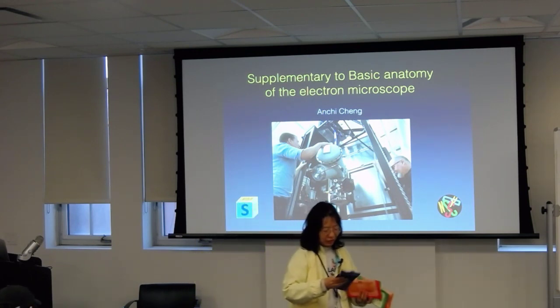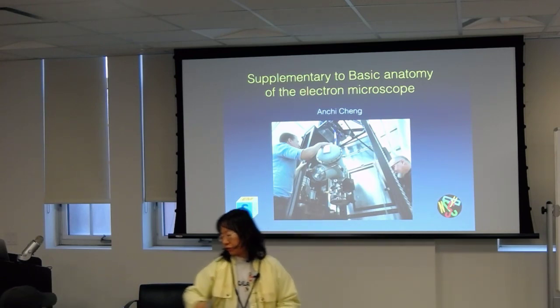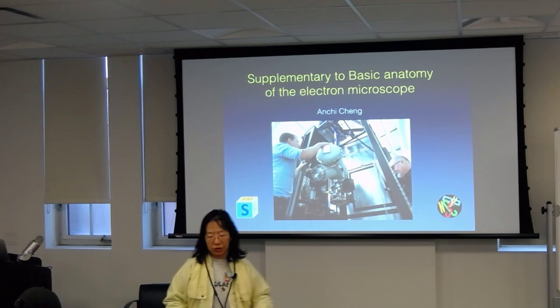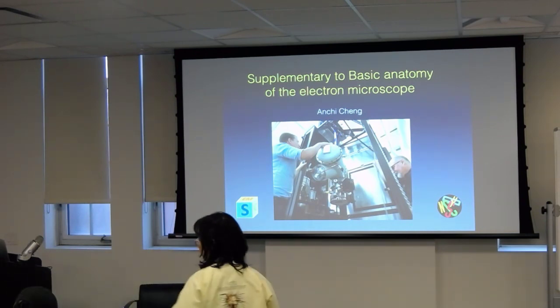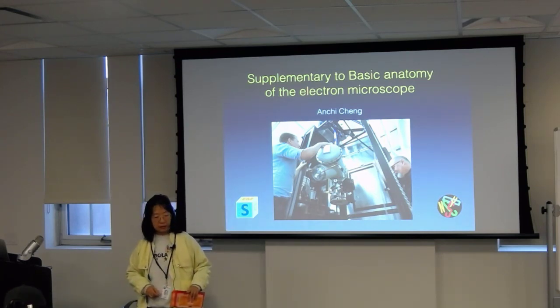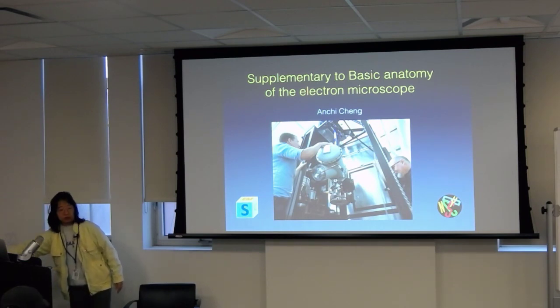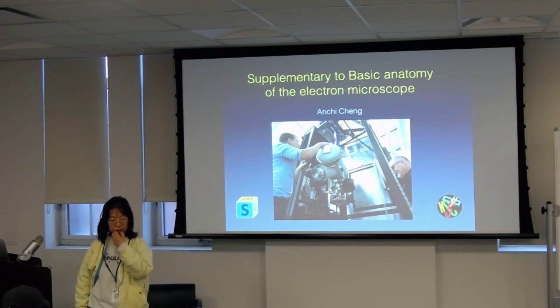But this is called a Foldscope. This is made by a Stanford professor who made this so that the idea is that he wants every child in the world to have a microscope in their hand. So this costs $1 to make. And we got quite a few here, because the last time we had some event here, President Clinton requested a bunch of those for high school teachers.